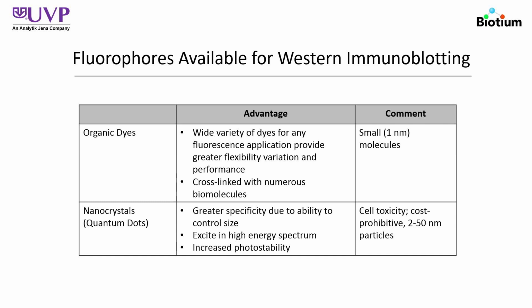These dyes are small molecules, and their color, or their fluorescence, excitation, and emission, is determined by the chemical structure of the dye. Because of their small size, they can be conjugated to antibodies, other proteins, or a variety of other biological molecules for different applications. And these dyes are fairly cost-effective.